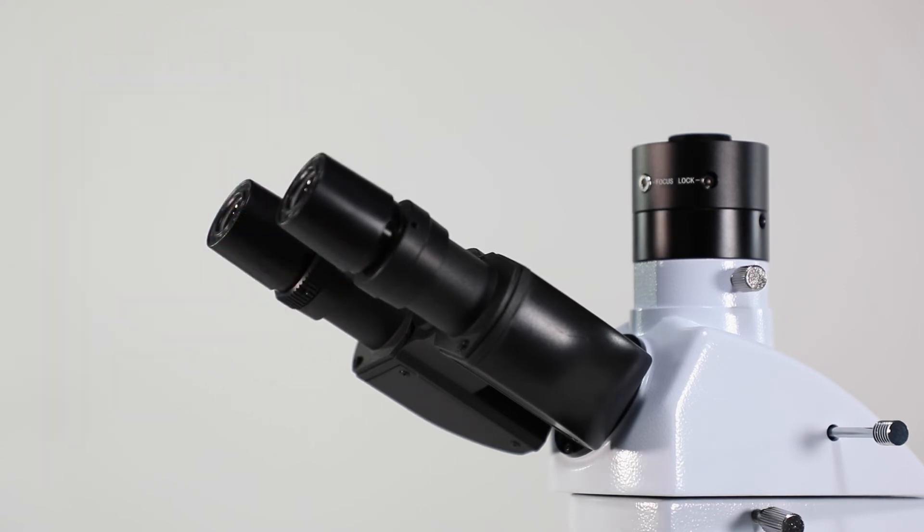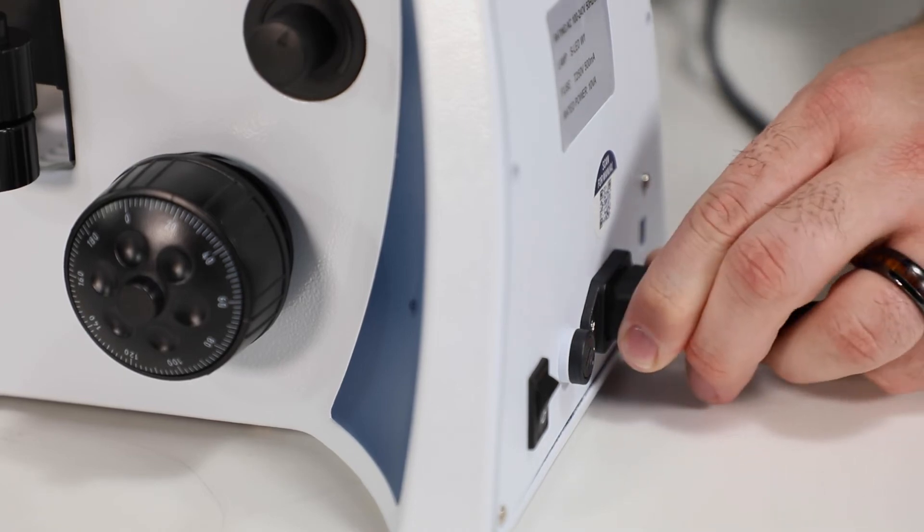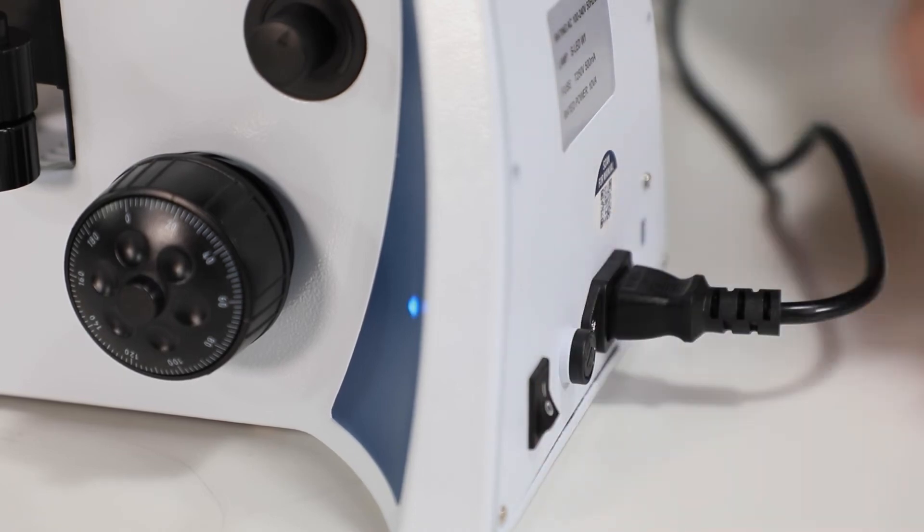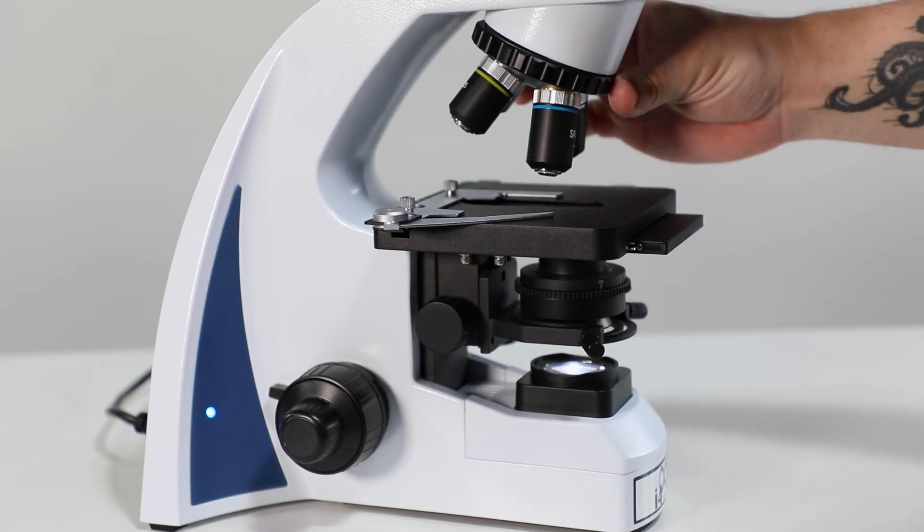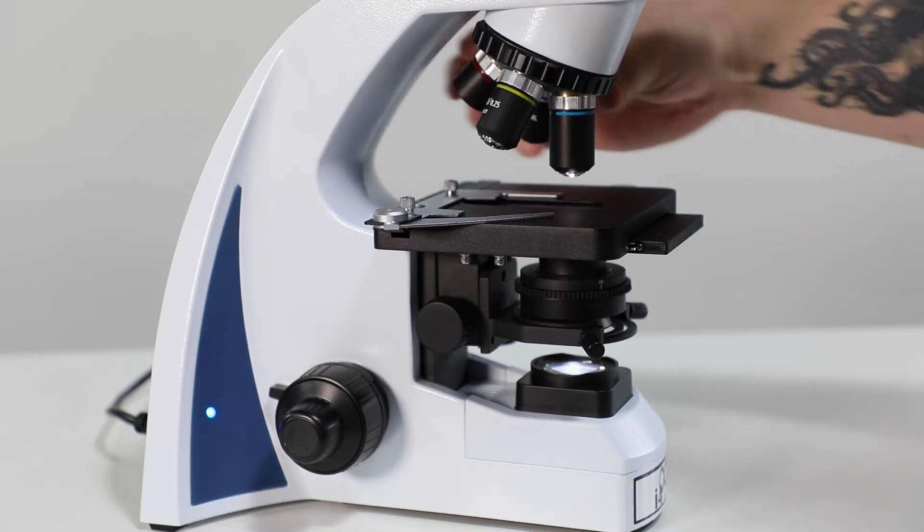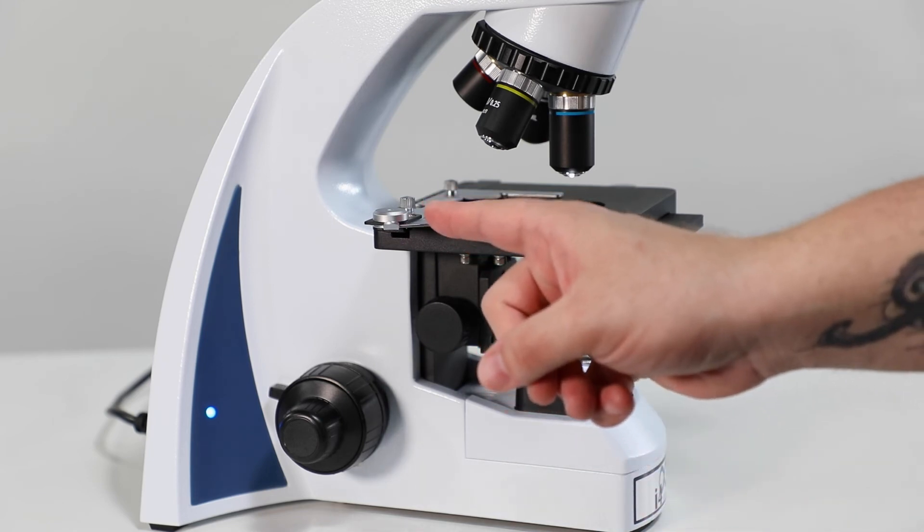The final step to setting up your microscope is setting your stage height. So plug in your power cord and turn on your microscope to get started. Make sure your microscope is moved to the 40x objective. Then place a prepared slide on the stage using the slide finger to secure it.